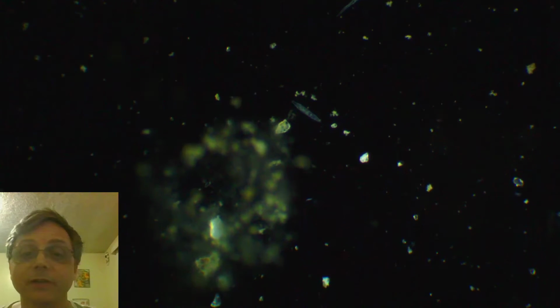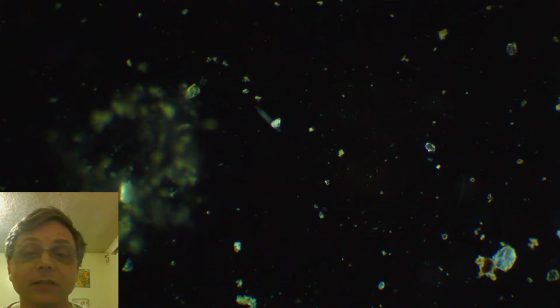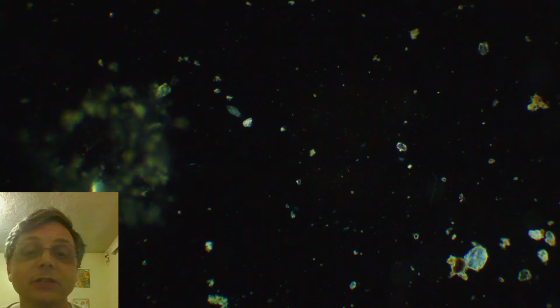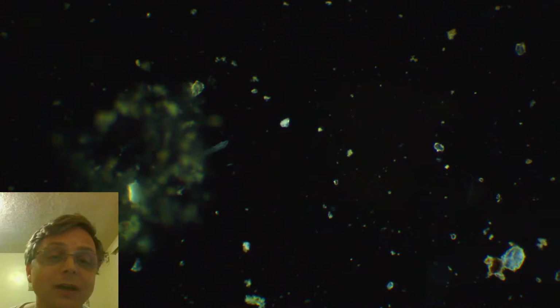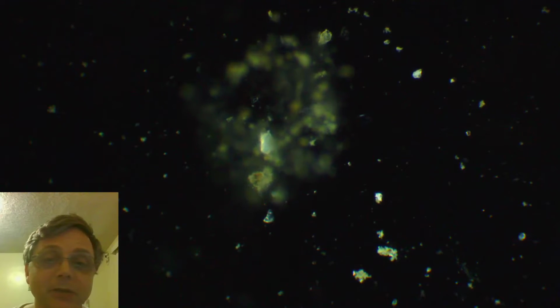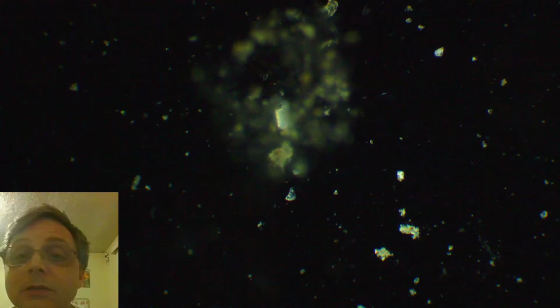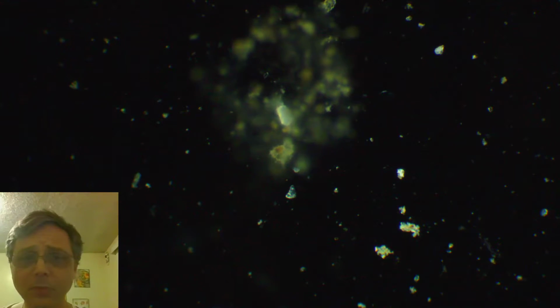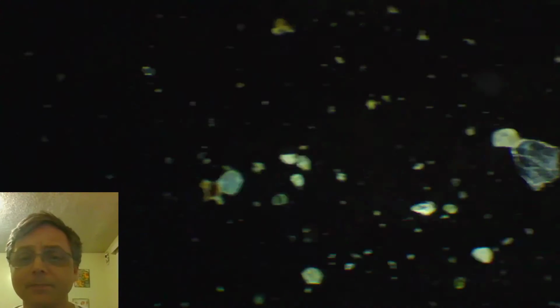Oh look, there's a worm-looking thing again. This is one of the first things I found, a worm-looking thing like this, like an inchworm kind of thing. I actually don't know if it's a worm or a larva or a rotifer. I don't think it's a rotifer, because the one time I did get a rotifer, you can clearly see his head and his little sweepers, or whatever you call them. Anyway, that worm wants to be underneath something.